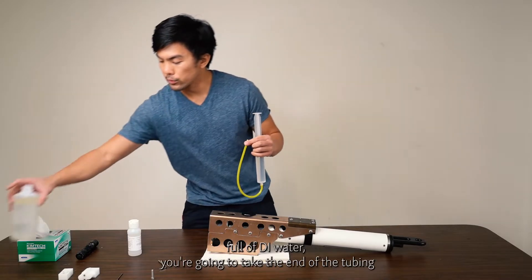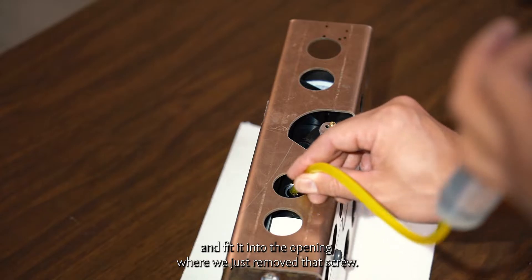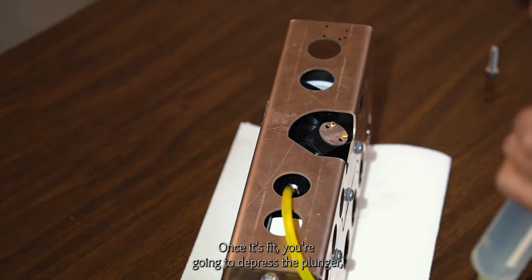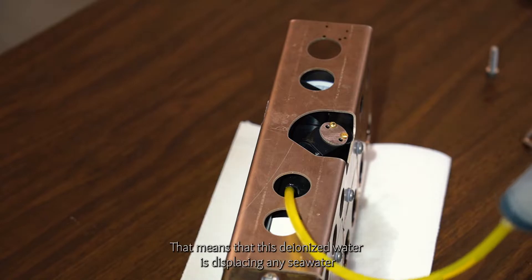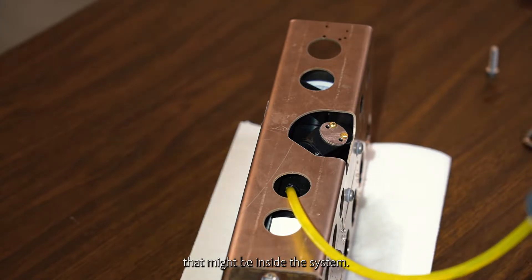Once you have the syringe full of deionized water, take the end of the tubing and fit it into the opening where we just removed the screw. Once it's fit, depress the plunger and you'll see water leaking out the sides of the HydroCat EP. That's good — it means the deionized water is displacing any seawater that might be inside the system.